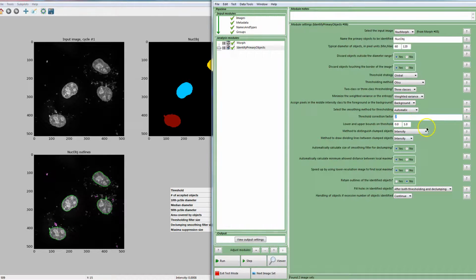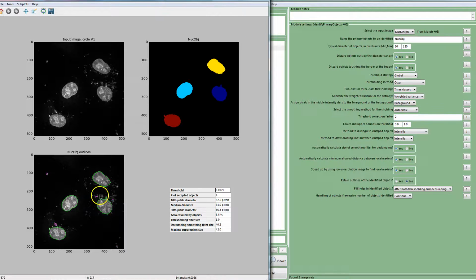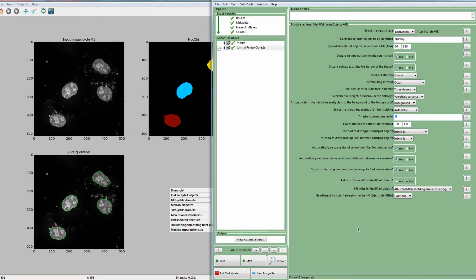And how you do this will obviously change the size very subtly, depending on the data sets. So bear in mind that this is going to change things a little bit, and you want to try it on the good ones, the bad ones, the medium ones, and see if it grabs the edge, and look at the green part to see if you're happy with where it's found that boundary. And that's the basics of finding the outside of a nuclear object. I'll do a more complicated, more in-depth one at some point in the future.